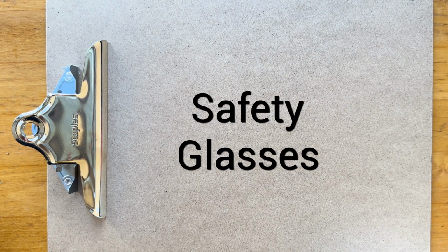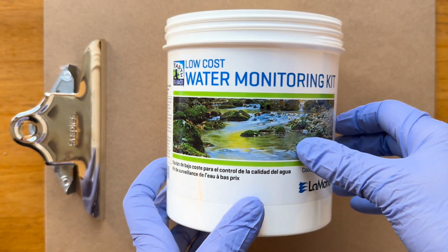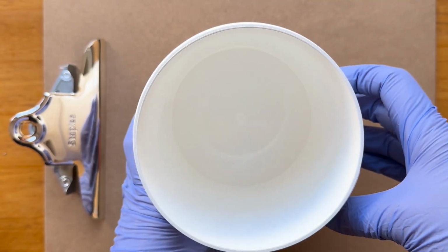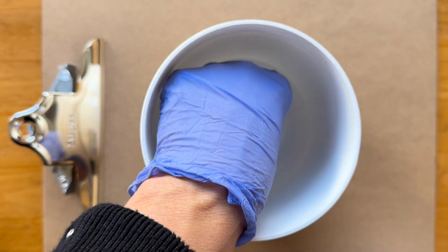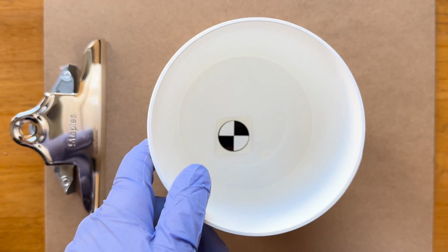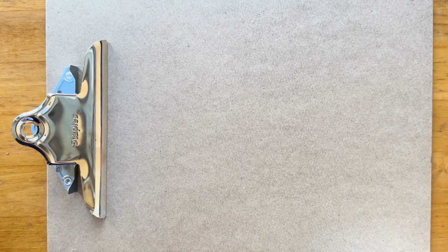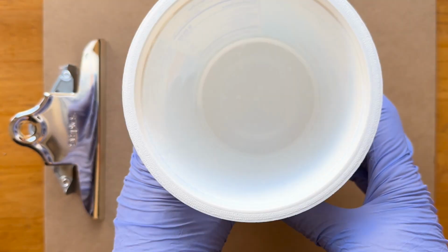And then you need to have, for the turbidity test, a water container. Now, the Lamont kit comes with its own container. This is used for one of the tests where you need to have a Secchi disc, which is provided in this kit, and it's going to be attached at the bottom, and you then add water and you test turbidity.